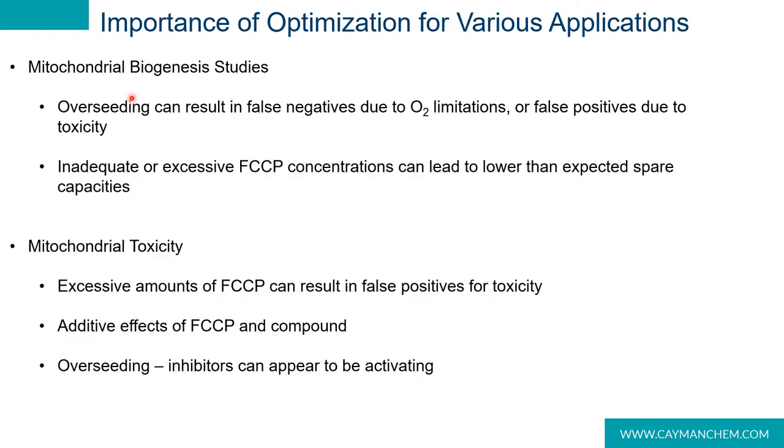So why do we care so much about optimization? Failure to properly optimize the cell system before performing a mitochondrial stress test can lead to a number of problems. When looking at mitochondrial biogenesis studies, overseeding the cells can result in false negatives due to oxygen limitations, or false positives due to inhibition resulting in a more linear respiration rate. Poorly titrated FCCP concentrations can result in inhibition due to toxic levels of the compound, or suboptimal levels resulting in under-measured maximal oxygen consumption values. With mitochondrial toxicity studies, an excess of FCCP can result in false positives, adding to the effects of a compound that wasn't actually toxic on its own.